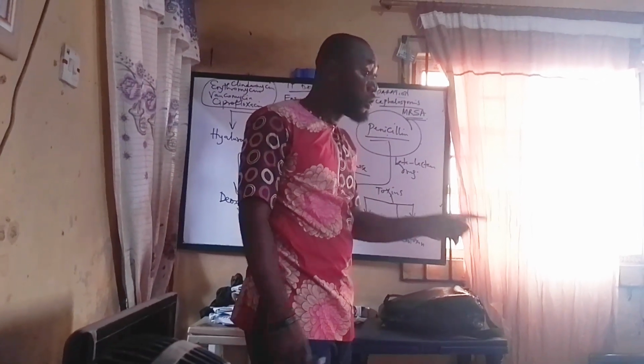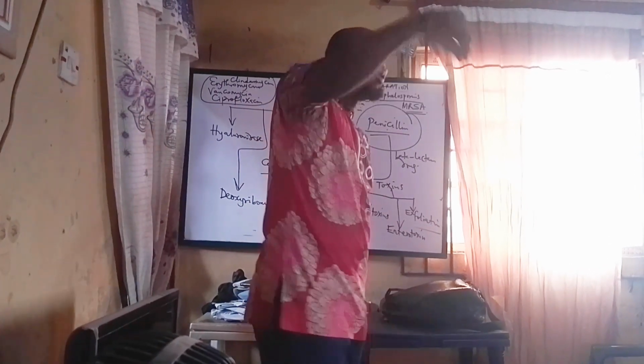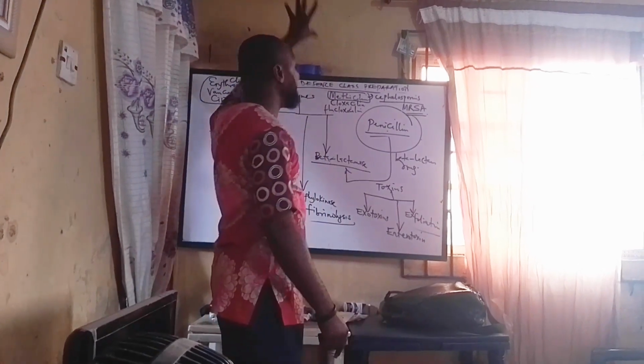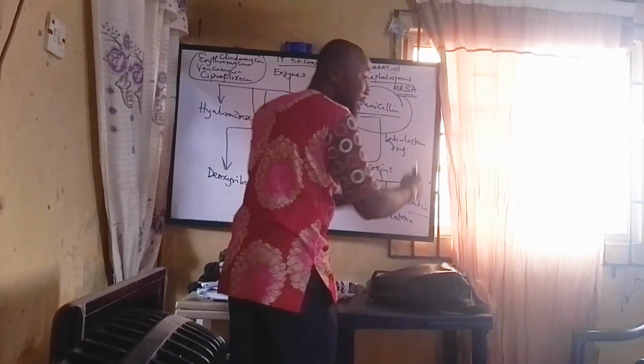Anything culture, you are saying you do culture. Even if it's not staph, maybe you saw, say, E. coli. You will tell them that you did biochemical test for E. coli. By the time you will come tomorrow, all the biochemical tests I will list them for you, and what they are used to test for. The one for staph, the one for strep, the one for E. coli, each of them will tell you.